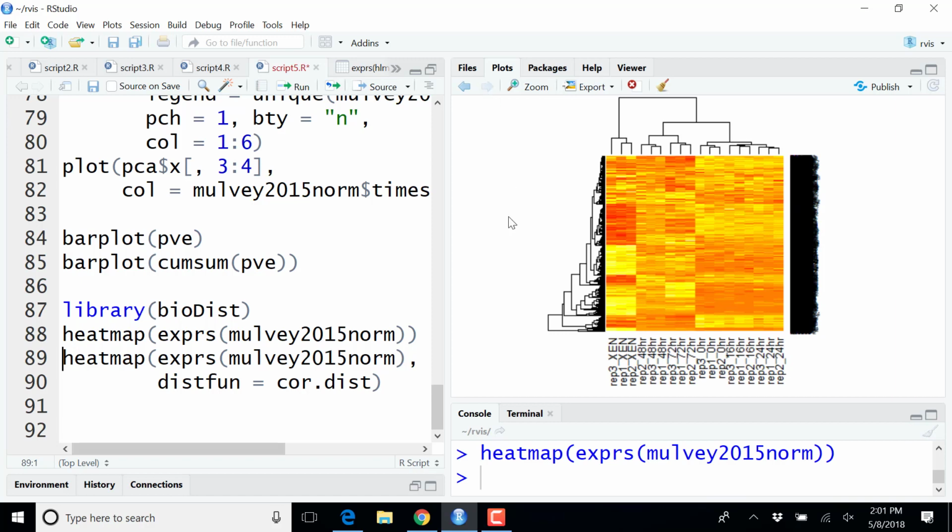Okay, right. Very different pattern in my feature cluster. So the issues that we identified for the clustering, of course, have an impact on the heat map because we use the clustering. The ordering of our columns and rows will be dependent on the clustering algorithm that we use, and of course on the distance matrices that we calculate.